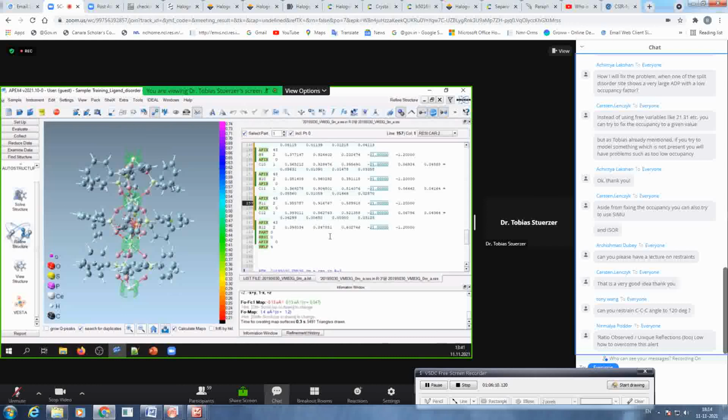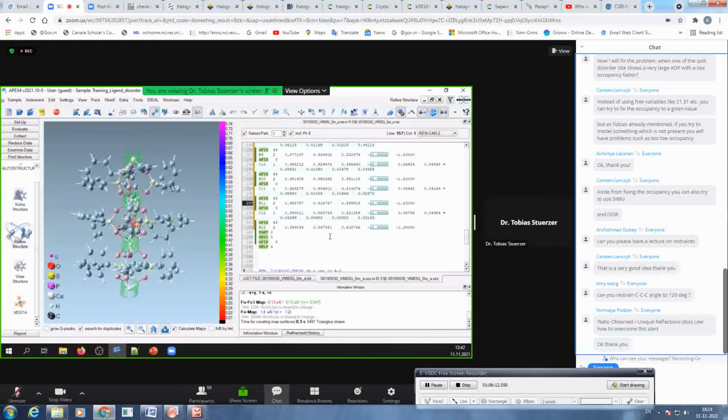Usually integration does a very good job, but for very rare cases, it's a little extra trick, which will not save the world, but make it a little better. I'm always happy to get the data and we have it.